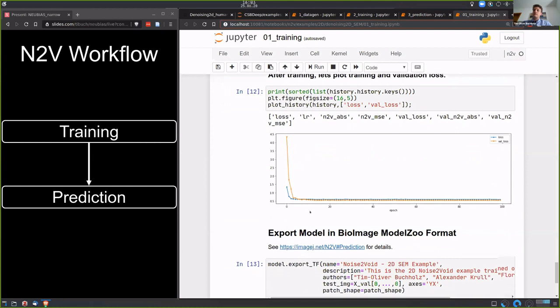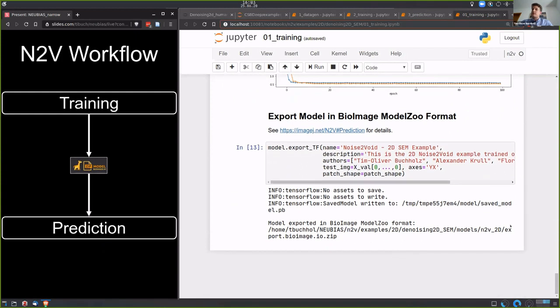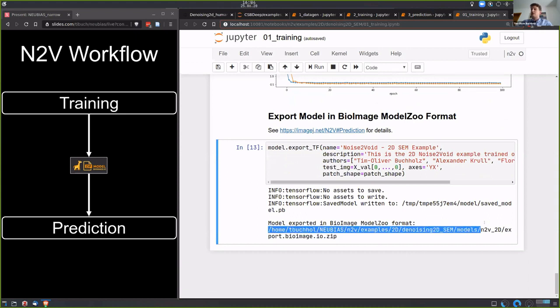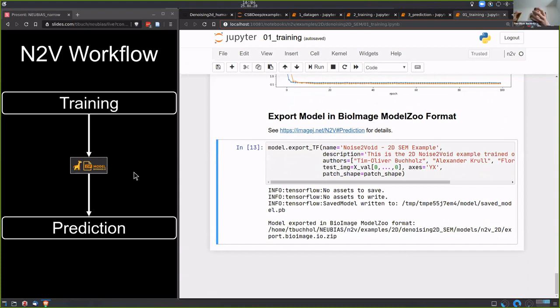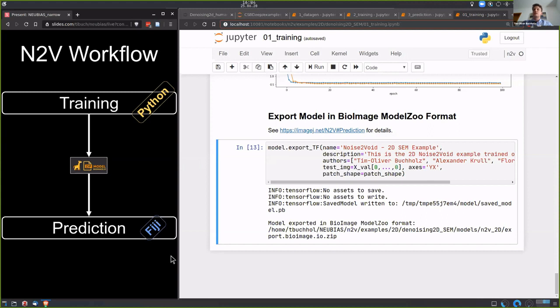Here I'd like to highlight exporting a trained model in the BioImage Model Zoo format. You execute one cell and it generates a ZIP file called 'export.bioimage.io.zip'. You can take this ZIP file and send it to a collaborator or, if you work in a facility, to users who just want to run prediction. Another cool thing: I trained this model here in Python, exported it, and sent it to Deborah, who will show how to use this trained model in Fiji.